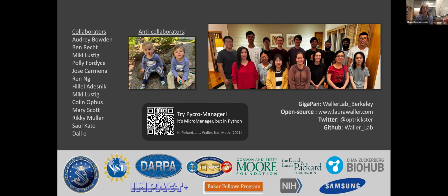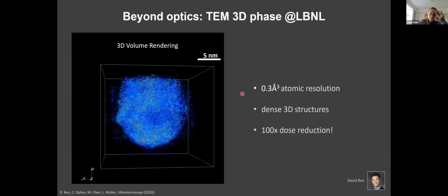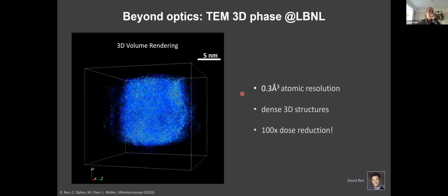We've got a few comments, a few questions. So Samuel is asking, in cryo-electron tomography, when samples are thick and hence have more scattering, I believe that would decrease the quality of reconstruction. I'm just wondering if this would be helpful in such a case. Oh, yes. So we have a project doing this for electron tomography, not cryo-electron tomography. Let me just show this. This is for material science type electron tomography.